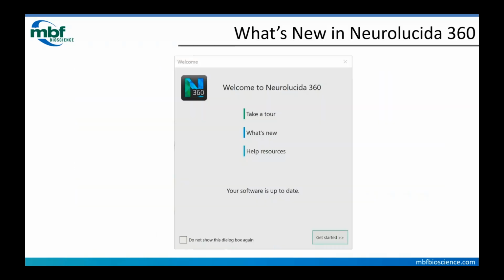We're always working hard to improve the software's functionality, but also your experience while using it. A few things that we've implemented recently include a refined user interface that's focused on making the tools you use most often easier to access. We've also created new help resources, including a dynamic search bar and additional ways for you to contact us for assistance. We provide in-software notifications about the new releases, so the software itself will let you know when there's a new version of the software.